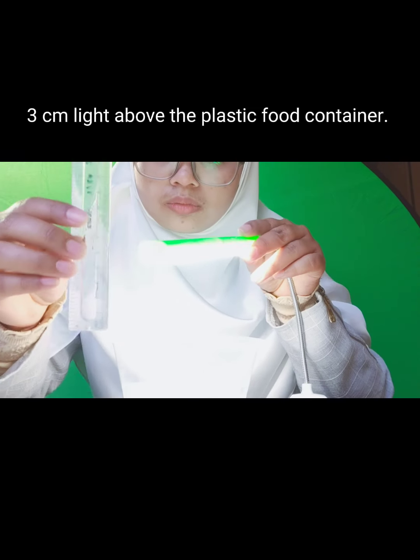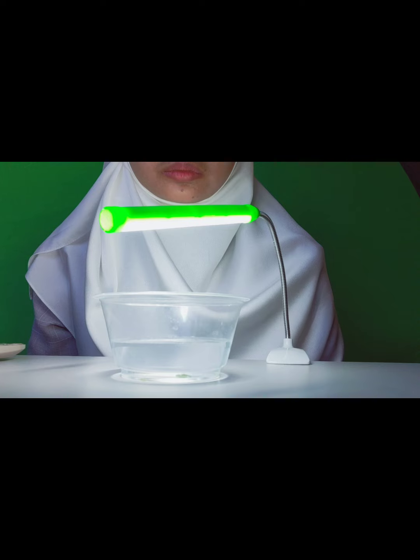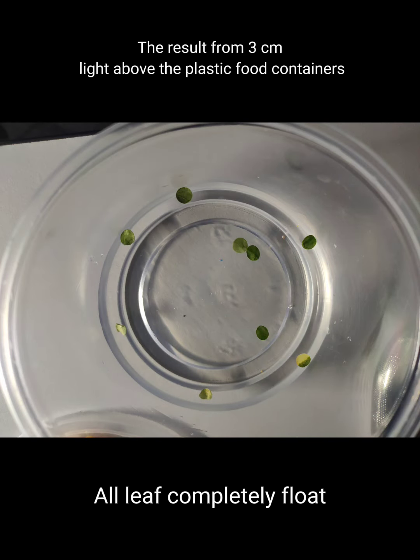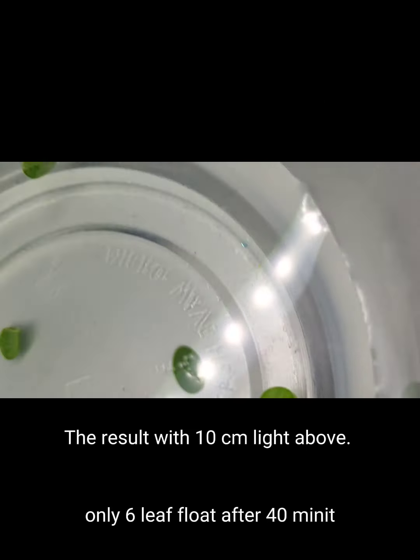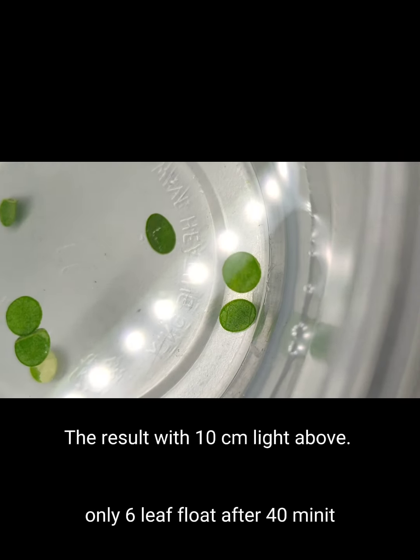So we observe it, and after 40 minutes we see the leaves floating. So this is the result, and then we continue with the 10 cm light. So we see only six leaves floating after 40 minutes when the light is 10 cm above it.